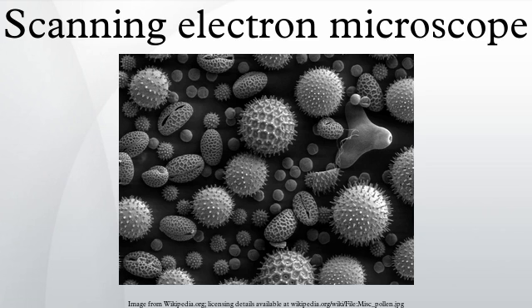Non-conductive specimens tend to charge when scanned by the electron beam, and especially in secondary electron imaging mode, this causes scanning faults and other image artifacts. They are therefore usually coated with an ultra-thin coating of electrically conducting material, deposited on the sample either by low vacuum sputter coating or by high vacuum evaporation. Conductive materials in current use for specimen coating include gold, gold-palladium alloy, platinum, osmium, iridium, tungsten, chromium, and graphite.